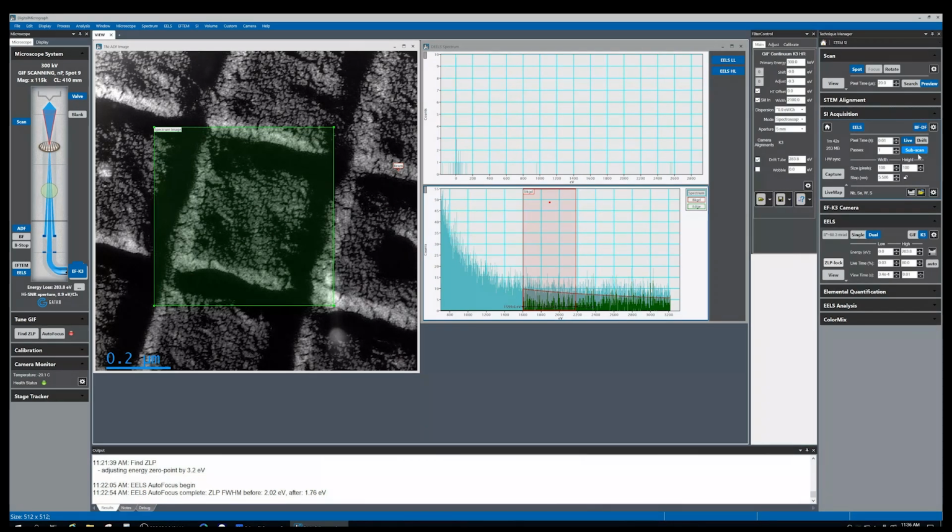So it increases the sampling rate when it takes the scan image. So basically when it takes this ADF image, it rasters the beam within 1 pixel, so that our resulting STEM image will have more pixels than our EELS maps.